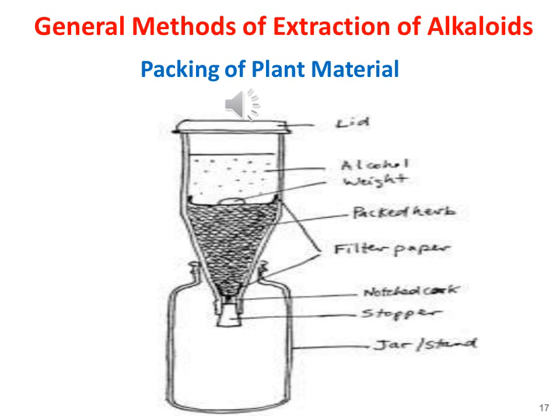Over the plant material I have placed another filter paper, over which I have placed a small weight so that the filter paper is not displaced. So this is the graphical representation of packing of the plant material used for the percolation process.